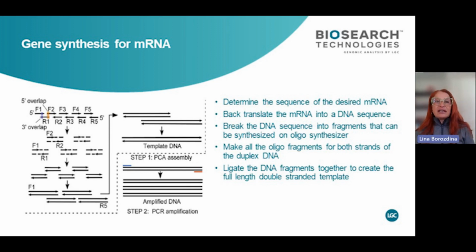The scientists cannot use a live virus, cut it, religate it, and inject it, because it's not a 100% reaction. So gene synthesis technology gives scientists the capability of designing a gene, putting it together while removing any dangerous bits out of it. For poliovirus, what they did was remove the replication cycle from it, pretty much castrating the virus.